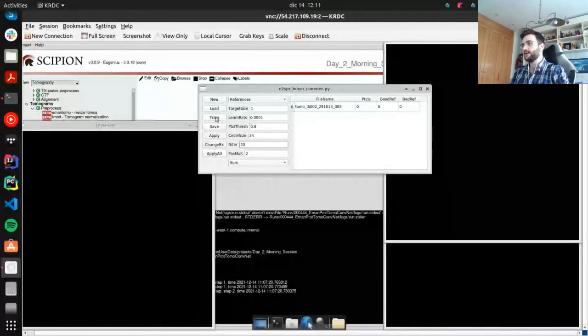Then here we have the buttons to work also with the network. We can create a new network. In fact, if you want, you can do it. But if you don't create it right now, when we click on train the network, EMAN will automatically create one. So if you forget to click here, there's no worries. Then you have the load button. This protocol is also interactive, and if you save the network with this button, you can afterwards open it and load it again to retrain it or to create a new one or whatever. And then we have the train button to train the network based on these parameters.